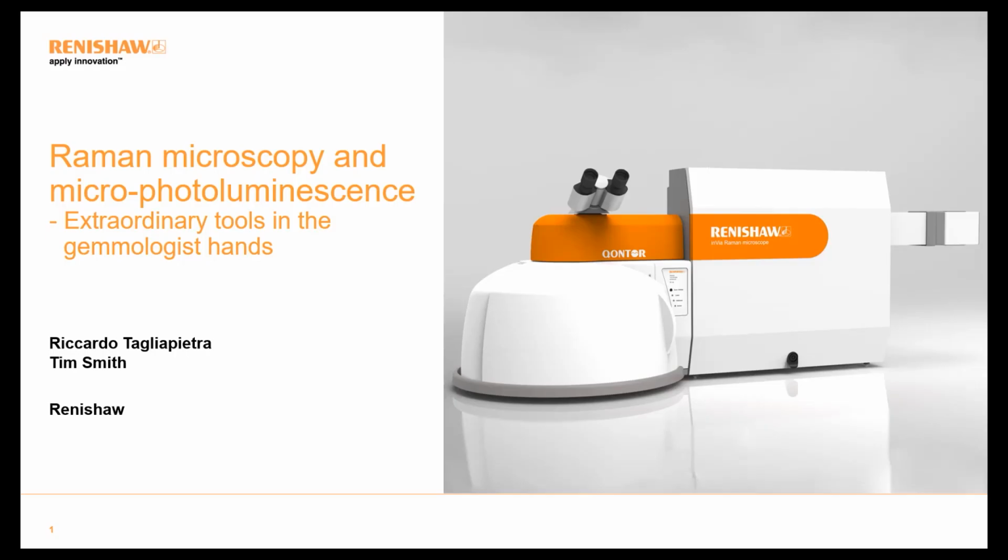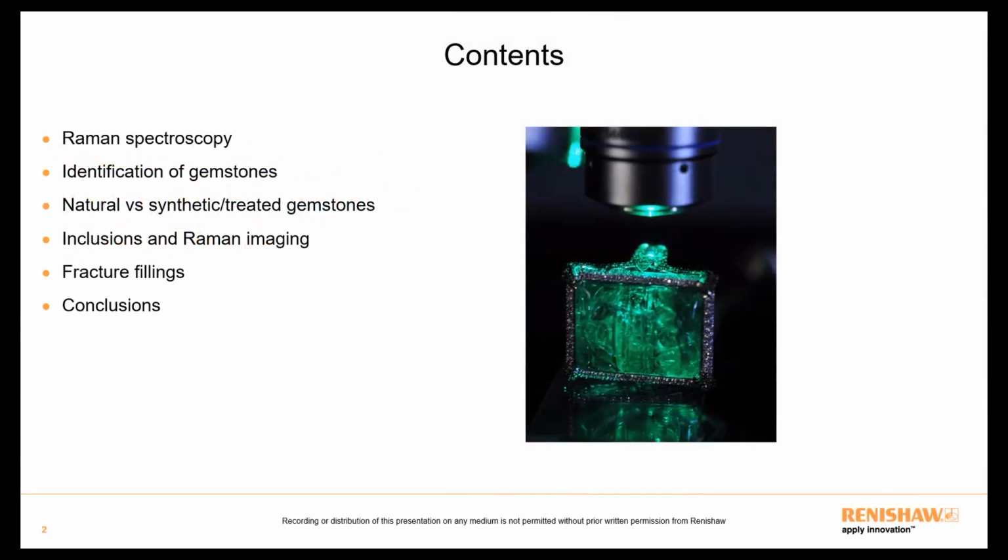Thanks Ian for the introduction, and welcome to this Renishaw webinar about Raman microscopy and photoluminescence as tools for the gemmological lab. Before getting into the specific contents, in this webinar you'll see how Raman spectroscopy can be applied to quickly and easily identify gemstones, determine modification and imperfections for both the gem lab or for research purposes.